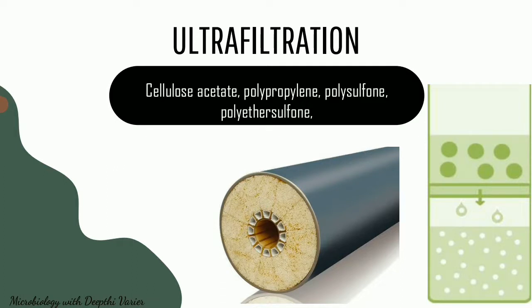Now what we do here is the viruses are separated from this mixture, which may have different size particles, by using a filter which has a very small pore size that can retain the larger particles, but allows the viruses to pass through. So when we pass the solution through the filter, as you can see over here, only the larger particles are retained, whereas the viruses, which are smaller in size, are going to pass through. So the viruses are obtained in the filtrate, which can then be purified or used for study of the viruses. Now for this, we need to use a filter which has an extremely small pore size.